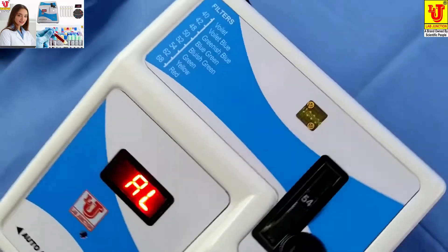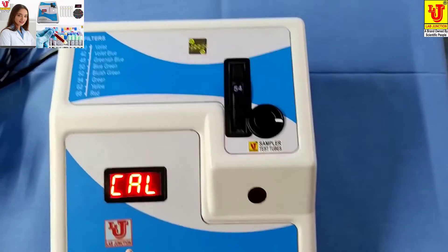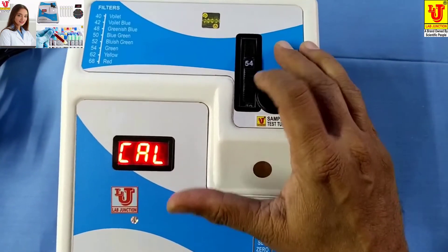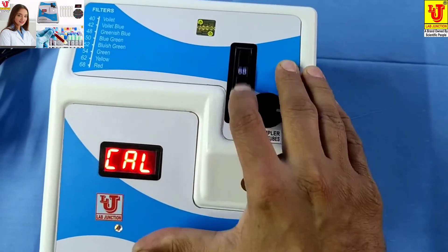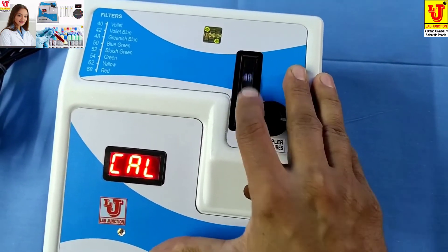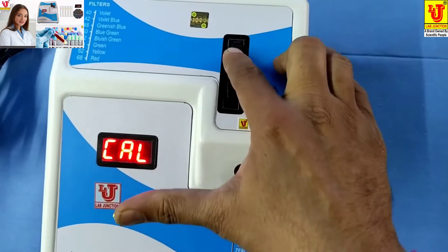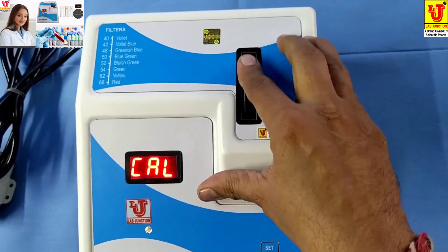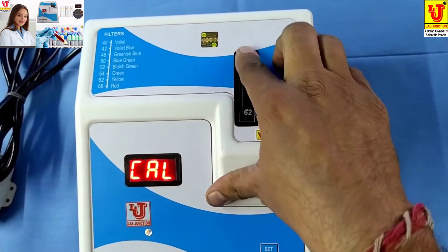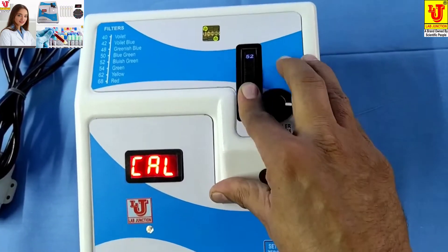Suppose we want to test glucose using the colorimeter. First, select your filter. The available filters are 540, 620, 680, 40, 420, 480, 500, 520, and 540. Glucose uses the 540 filter. Select this filter like this.